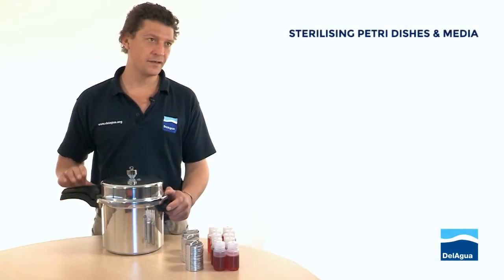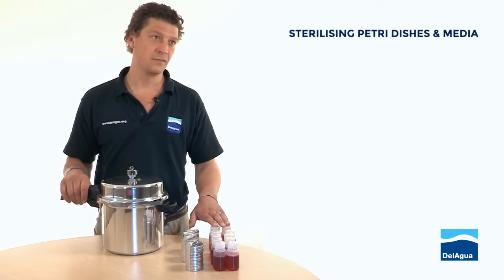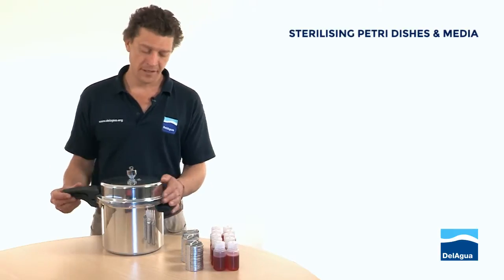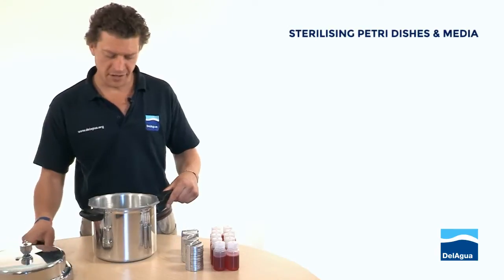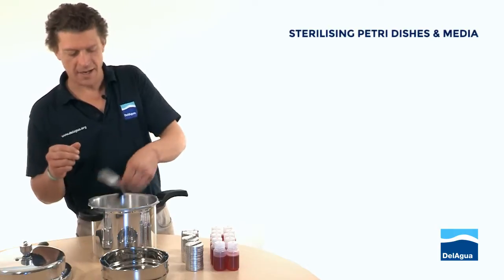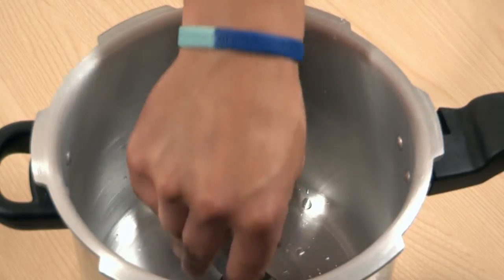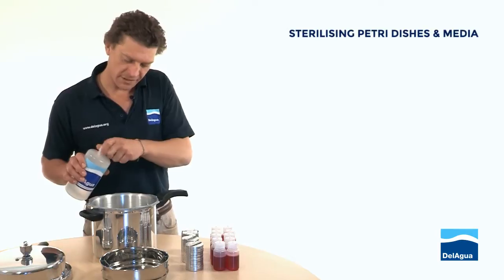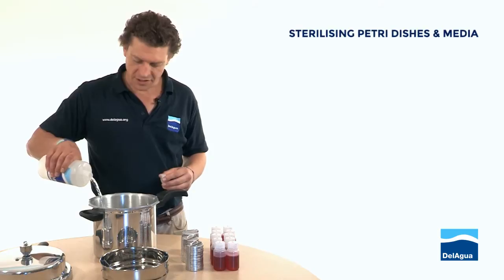The important thing with sterilizing is that the plastic bottles themselves most importantly don't come into contact with the water because they don't melt. In order to prevent that, we open our steam sterilizer. You'll notice inside there's a load tray and there are a couple of cradles, supports. We place those in the bottom of the steam sterilizer and put sufficient volume of water to cover the bottom but not to cover the top of the support.